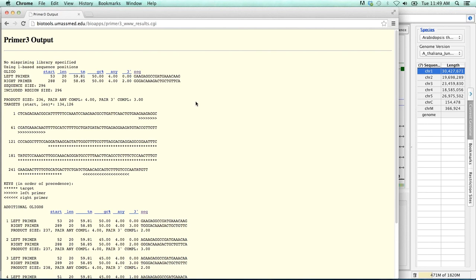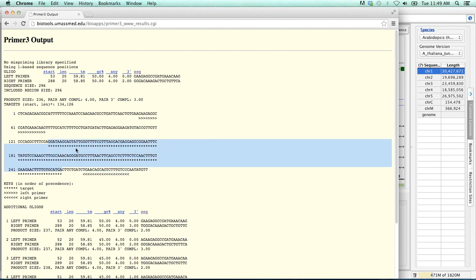And as you can see, Primer3 has very quickly found us two primers. You can see these primers in this text box here. This is the defined intervening sequence, our two primers, the forward and reverse, and then our product size of 236 base pairs.